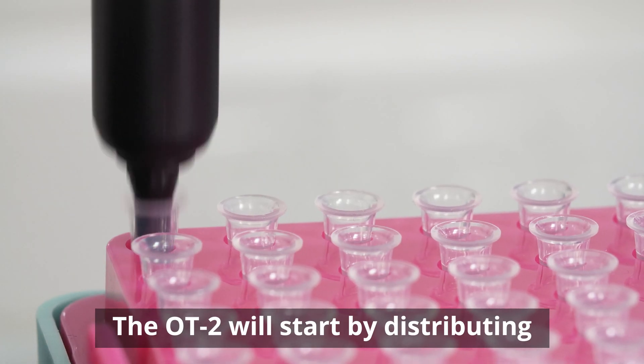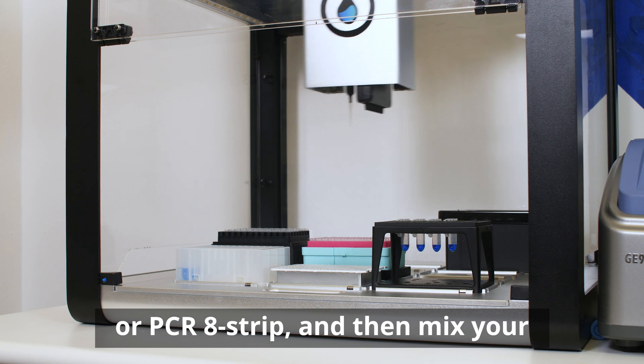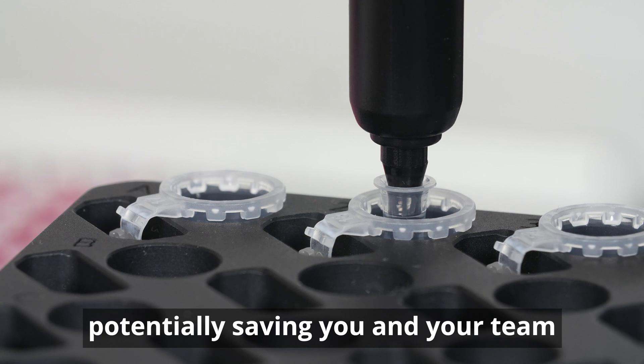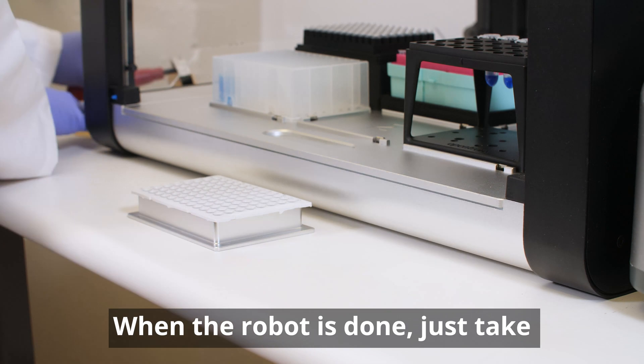The OT2 will start by distributing master mix into your reaction plate or PCR-8 strip, and then mix your samples with the master mix, potentially saving you and your team hours of repetitive pipetting every week.